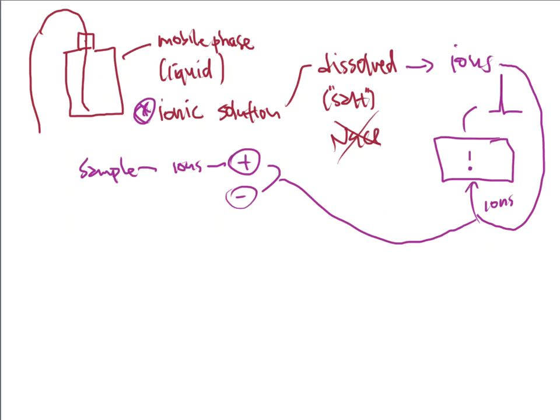So your very first instinct will be, well, why use the ionic solutions, right? Why can't we just use something like DI water? And we've also discussed that in the history lesson. We said that the water does a perfectly fine job. The problem is the retention times. It doesn't really separate components from each other.